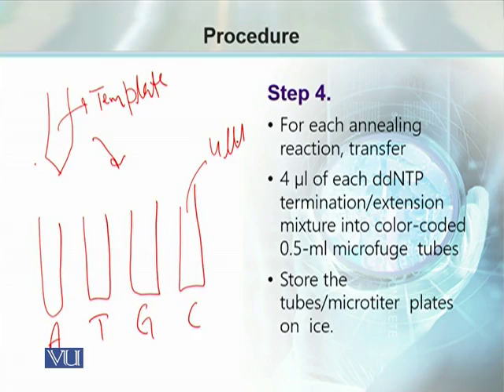and this is going to be stored on ice because the volume is so little. If we don't maintain the temperature, then it is going to evaporate because of the room temperature.